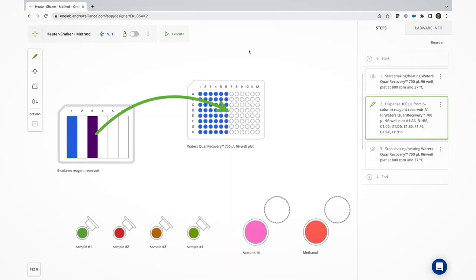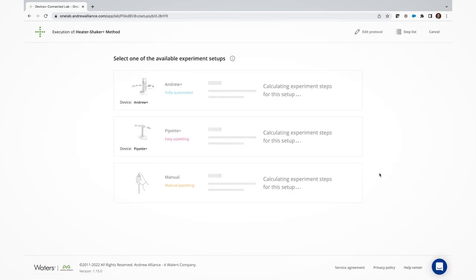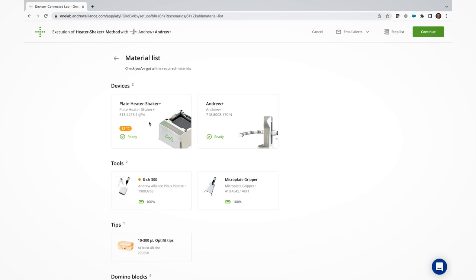Once your protocol is built, click on Execute and OneLab will calculate the best configuration for your method based on the available devices and pipettes, while suggesting different execution options. Choose the one that's most relevant to your current process between a manual run, a guided run with the addition of connected pipettes, or an automated run, and you're good to go.